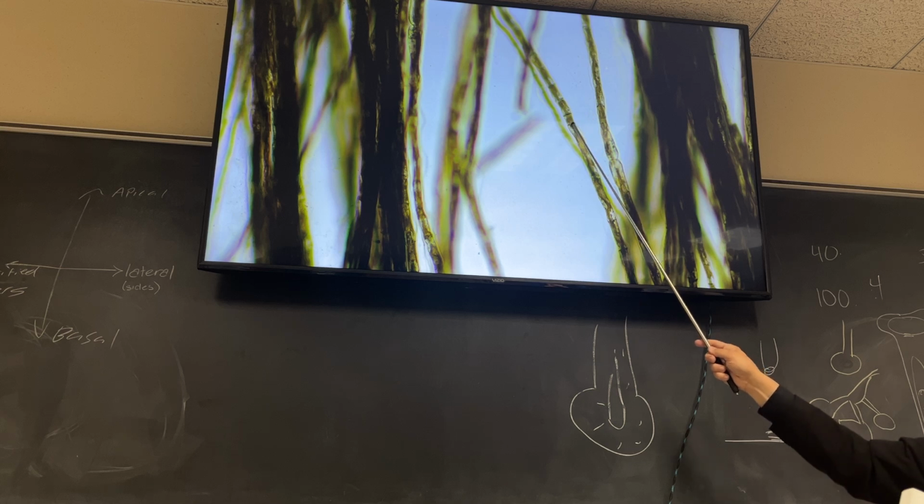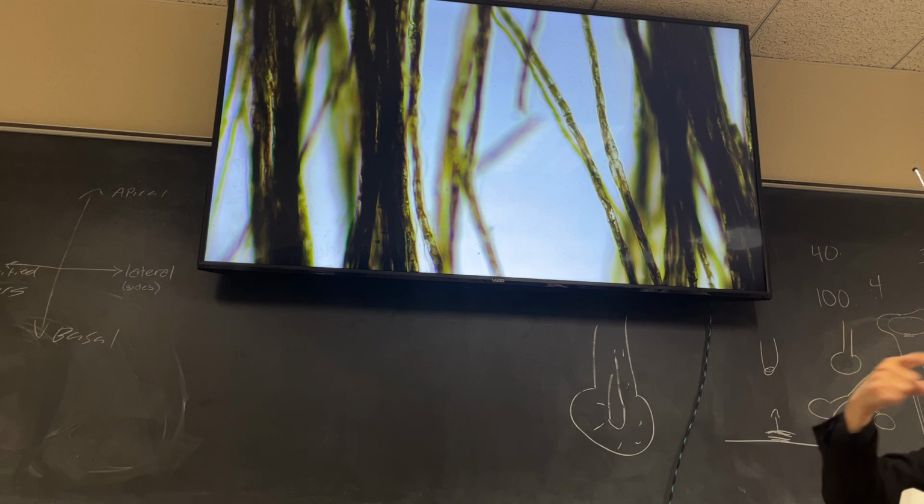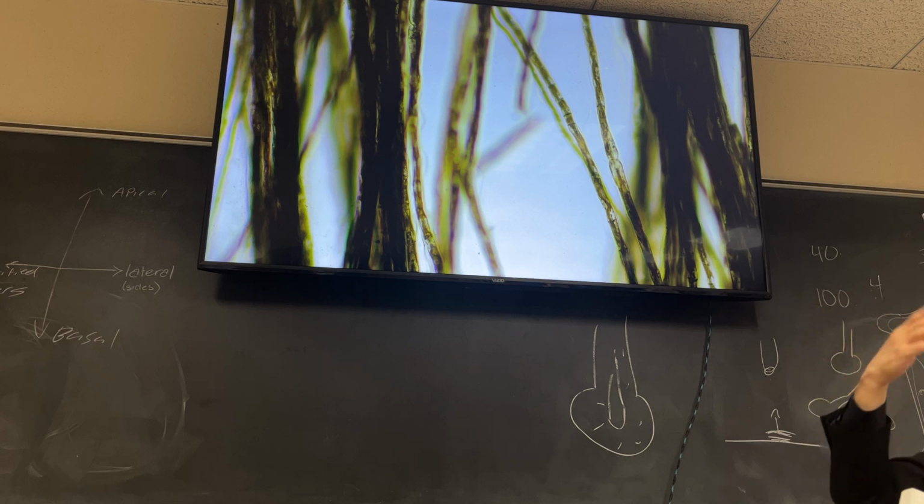So these little dark lines are the length of the cell that's laying down the myelin. So that's one myelin group versus another. These lines between the myelin layers are called incisures of Schmidt-Lanterman. That's just the edges of each little myelin packet.